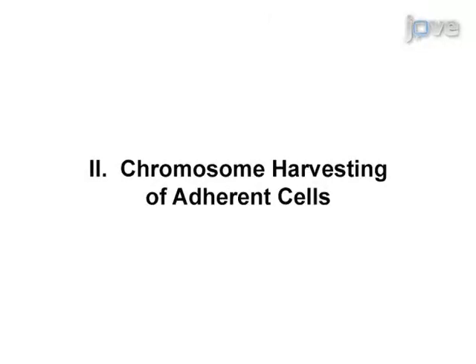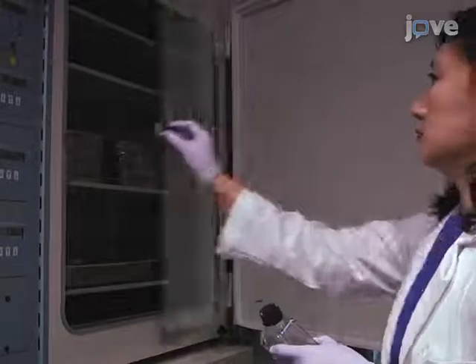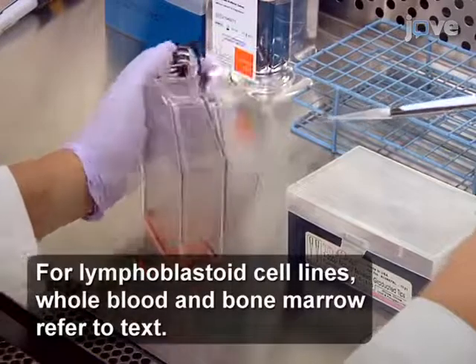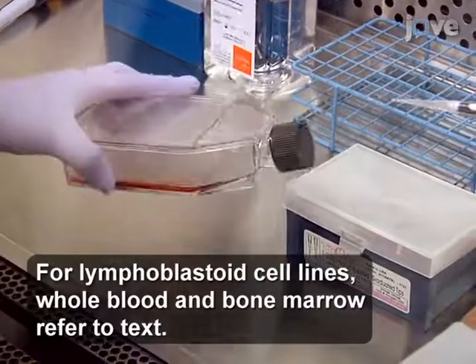Though this method can provide insight into chromosome rearrangements found in various types of human cells, it can also be applied to cells from other organisms such as rhesus macaques, rats, and mice. To begin, culture two million adherent cells to 80% confluency, add 10 microliters of 10 micrograms per milliliter colsumid per milliliter of cells, and incubate the cells at 37 degrees Celsius in 5% CO2.